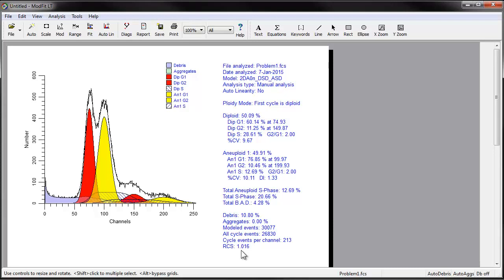Manual analysis must be used when the peak finder finds no peaks, as in this example, or if automatic analysis fails for some obscure reason. You may also use it any time you need to make your own decisions about how to model a sample.